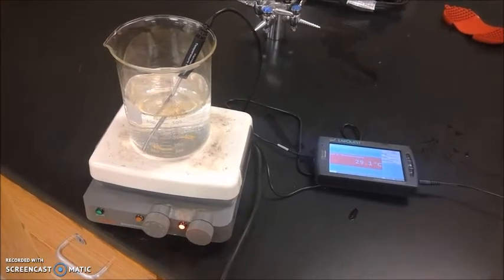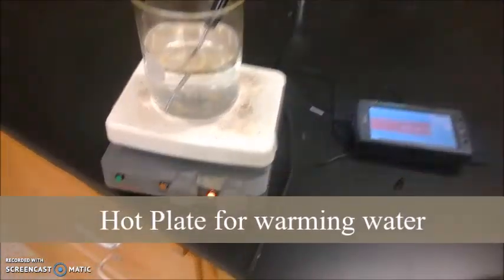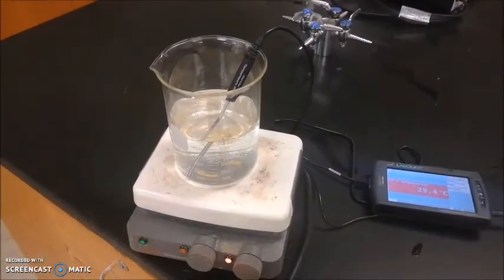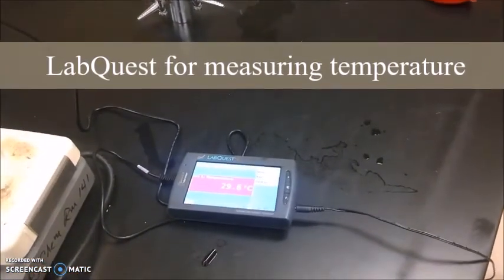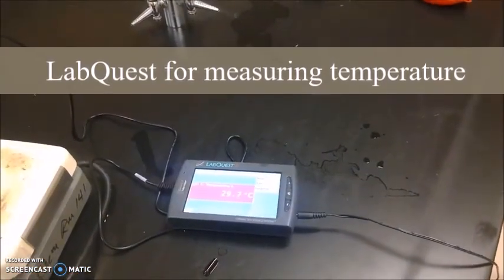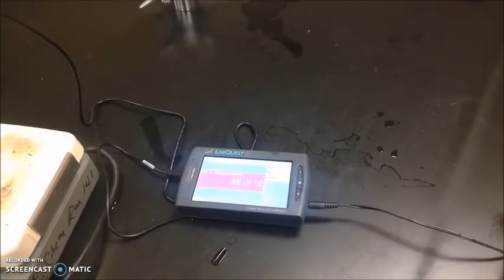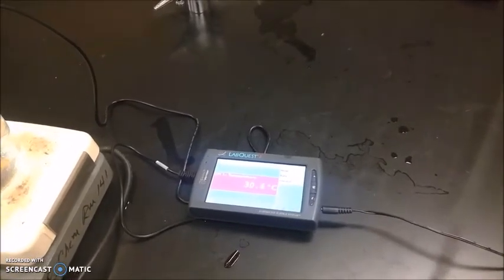To start off this lab, we're going to take a sample of water and heat it. We're going to need a hot plate, a beaker of water, and to record temperature, we're going to use this device known as a LabQuest. It is a digital device made by Vernier that allows us to measure temperature and a bunch of other things. If we end up having issues with this, we'll just go to our standard bulb thermometers.